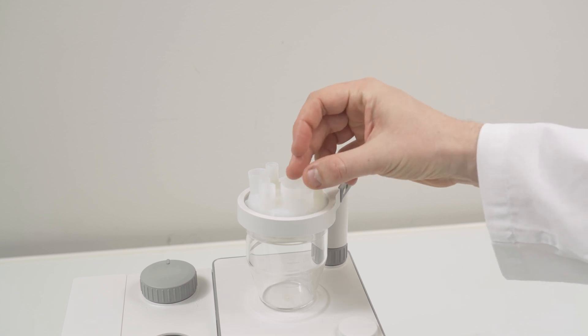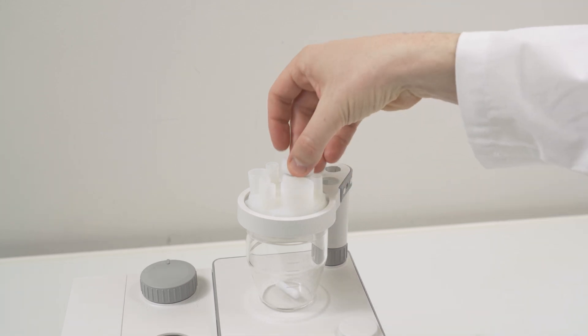Add the magnetic stir bar to the vessel and close the opening with the M24 stopper. Also here make sure that you close it properly.